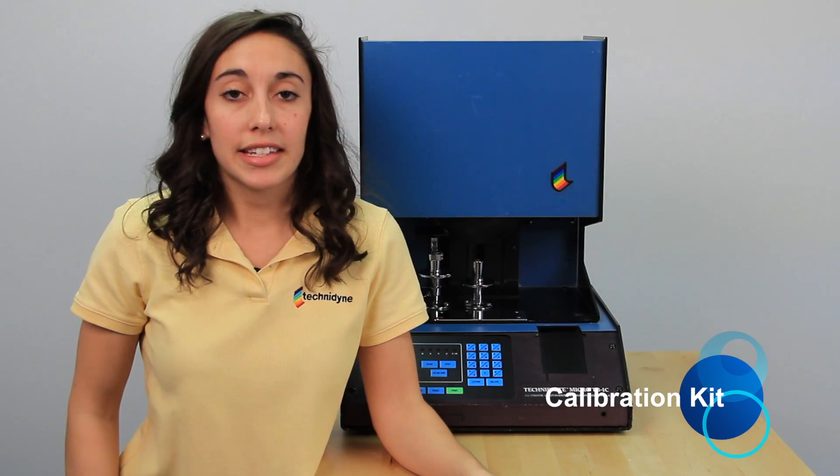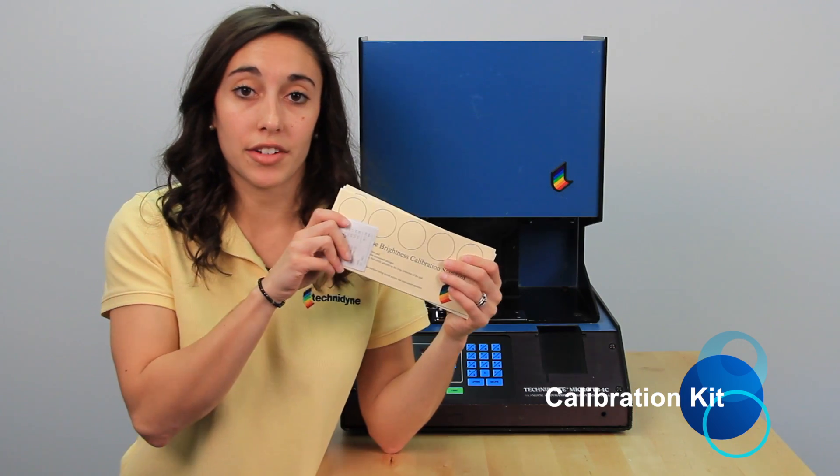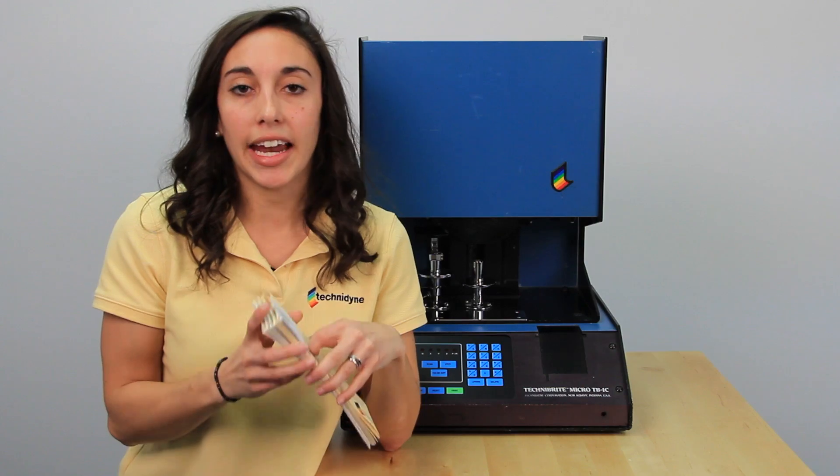The first thing that you should have is your calibration kit. Inside that calibration kit, you'll find five sets of calibration standards. There should be a 50, a 60, a 70, an 80, and a 90.